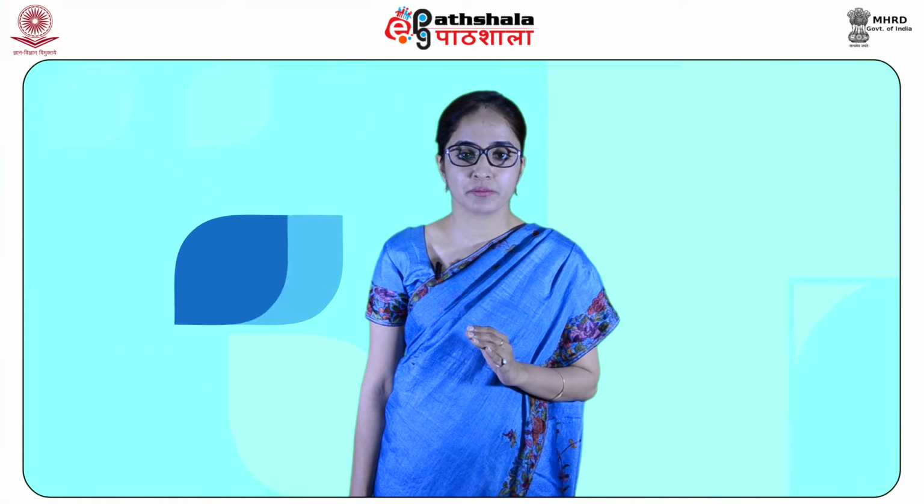to NMR spectroscopy. Because of its favorable nuclear properties and high abundance, 19F NMR spectroscopy is highly sensitive and fast as compared to proton NMR spectroscopy. Indeed, the 19F nucleus is the second most receptive NMR nucleus after proton nucleus. Now, the 19F NMR chemical shift range is very wide, that is from 0 to 200 ppm, as compared to that of proton NMR, in which the range is 0 to 15 ppm only.